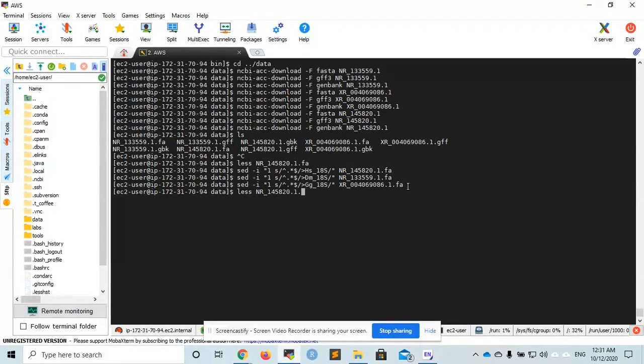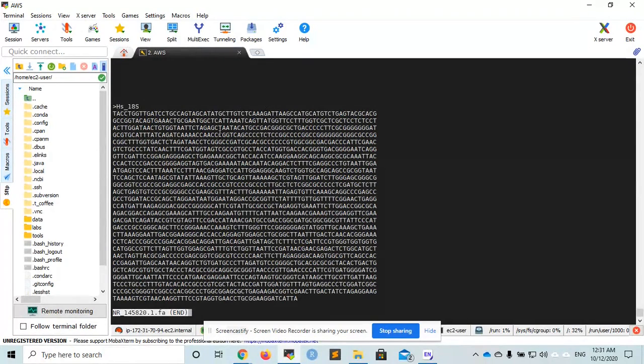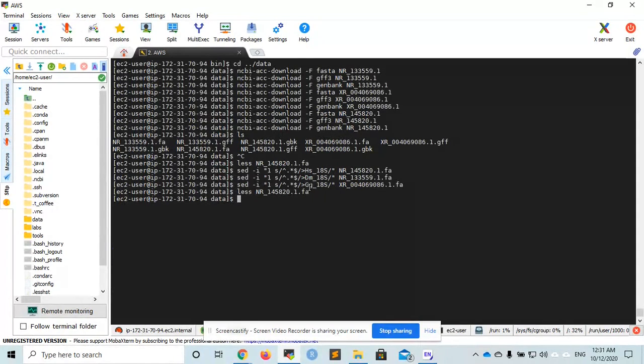Now, if I open one of these files, I will see that the header line has been modified to Homo sapiens 18s, and so forth for Drosophila melanogaster and Gorilla.